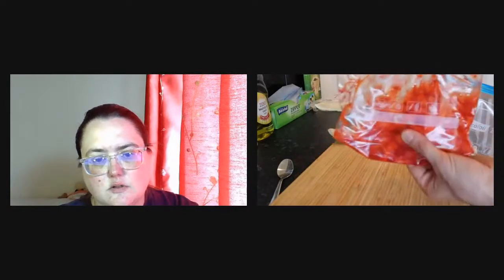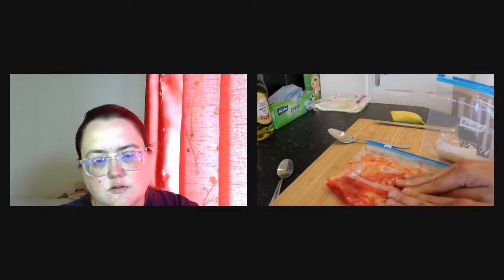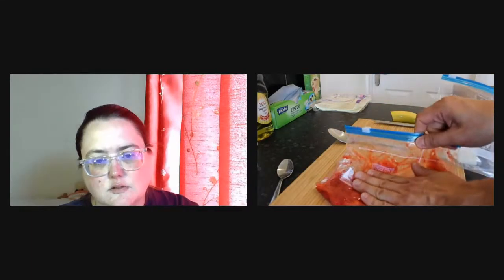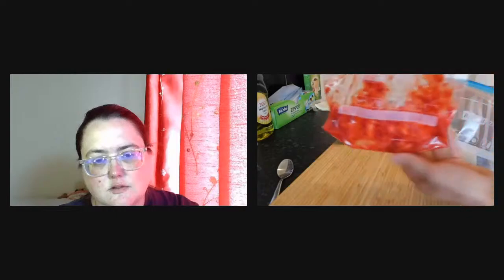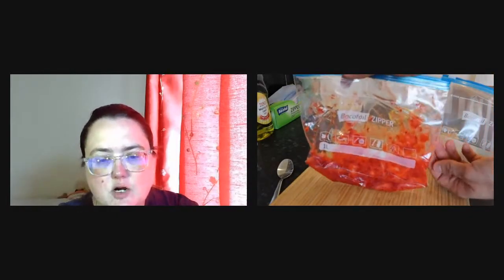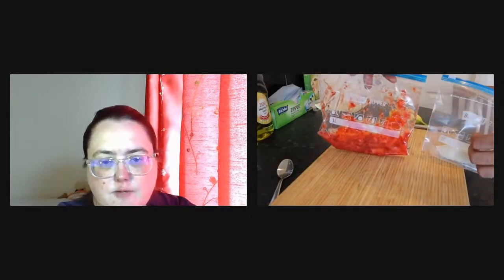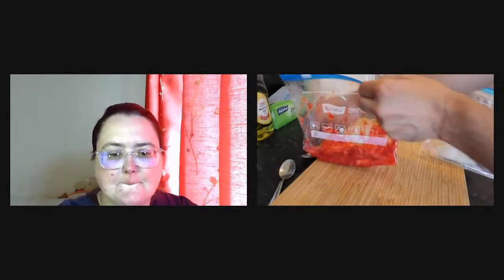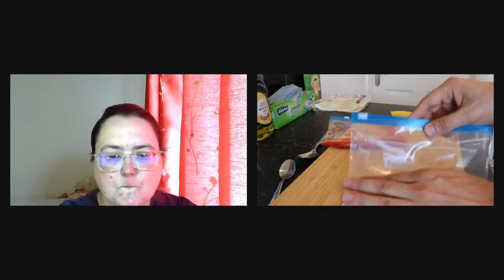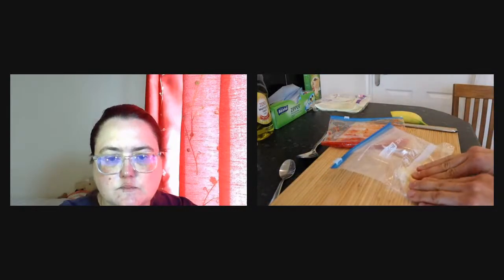I think this is a good start. You can see, I still have big chunks in here. Can you see well what it looks like now? Yes, it looks a lot like a puree with some little chunks, but nothing very big in there. Yeah. So we have that in here, and we're going to do the same for the banana. I think the banana usually is much easier.